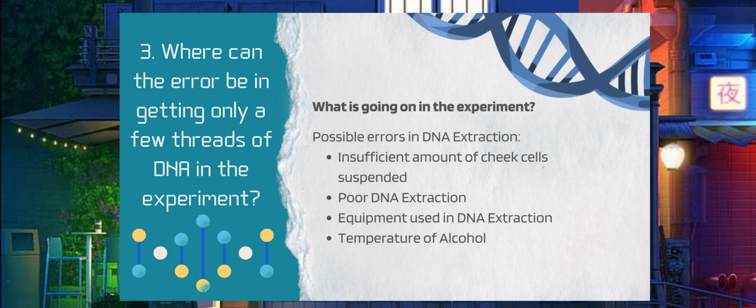As a result, thousands of our DNA molecules are clumped together in the white strings that we see, and it is important to note that single DNA molecules are far too tiny to perceive with the naked eye. Furthermore, when we gargle with salt water, we also gather bacterial cells that reside inside our mouth. So the clumped DNA that we see is a mix of our DNA and bacterial DNA. Okay, that's basically what DNA extraction is all about.